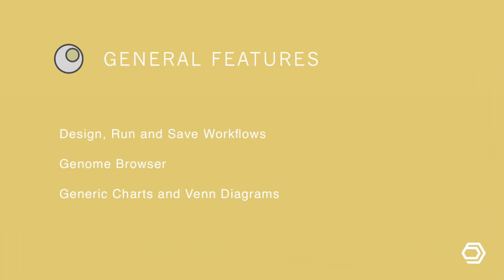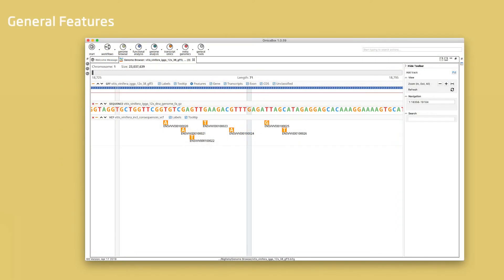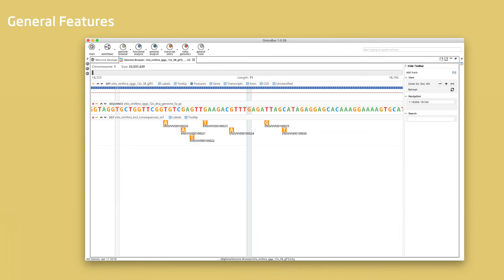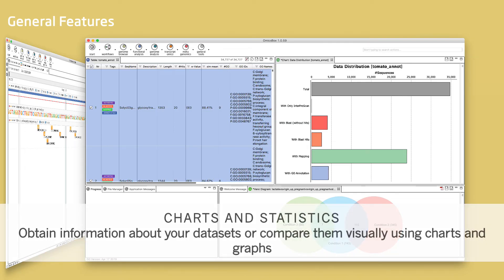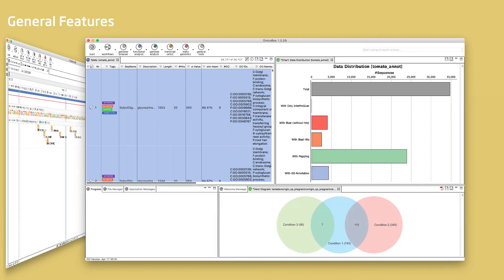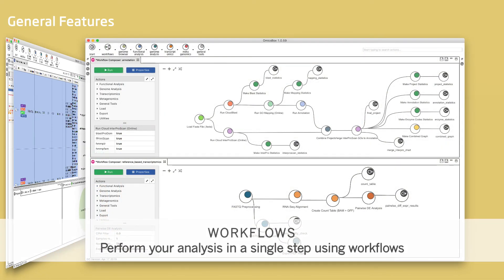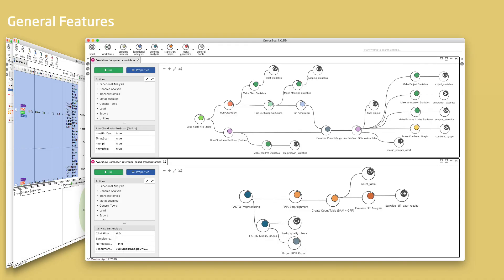Omisbox also offers many general features like next-generation sequencing quality control tools and a genome browser. The genome browser allows to combine and view genome alignments and annotations as tracks. Many different charts and statistics are available for individual analysis steps. Venn diagrams allow to compare different datasets easily. The workflow tools allow you to design and run different bioinformatics pipelines in a reproducible and easy way, and are a great way to learn bioinformatics.